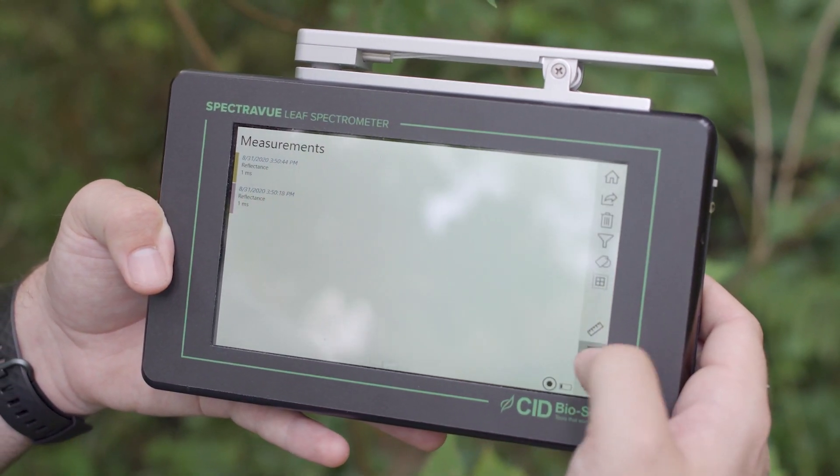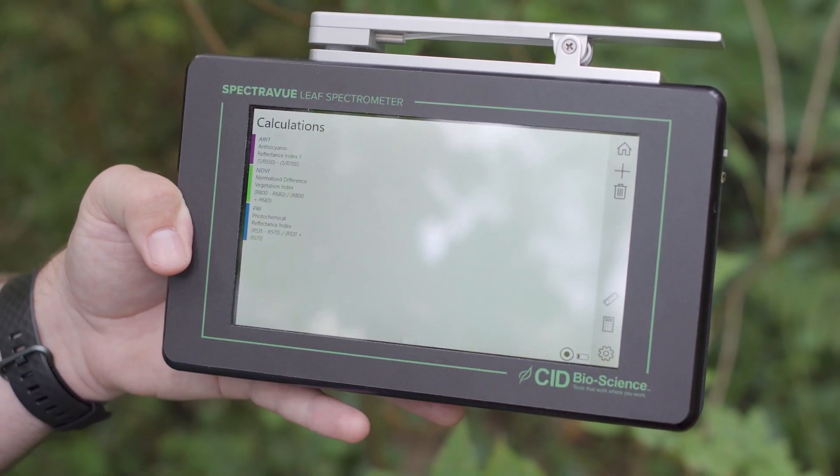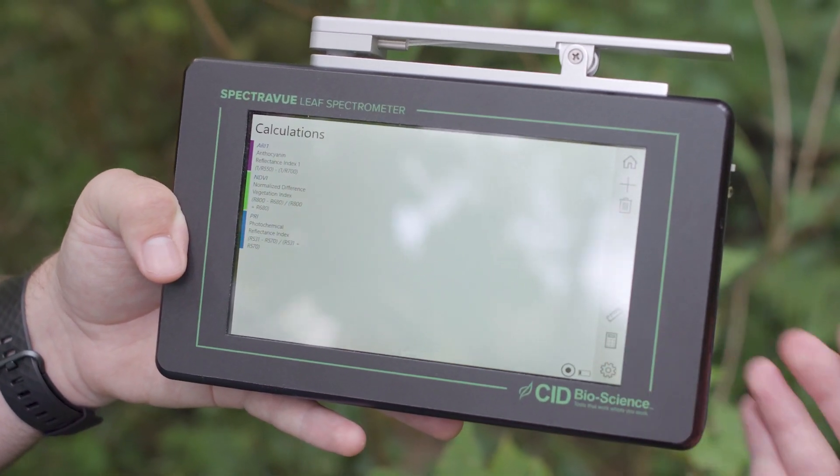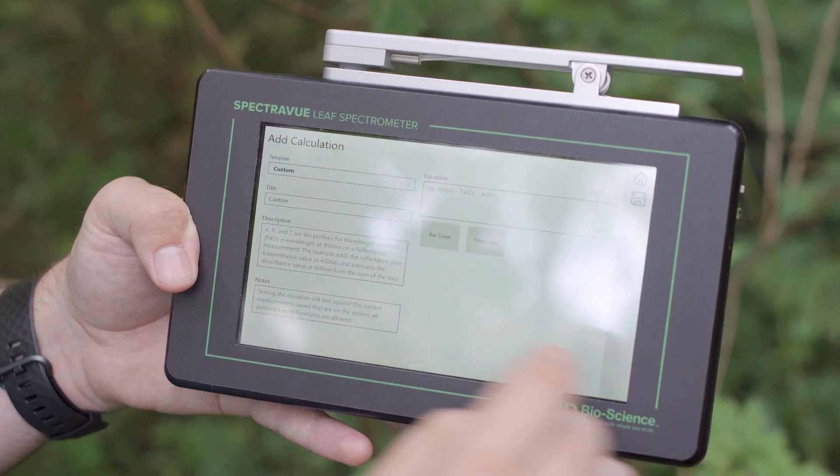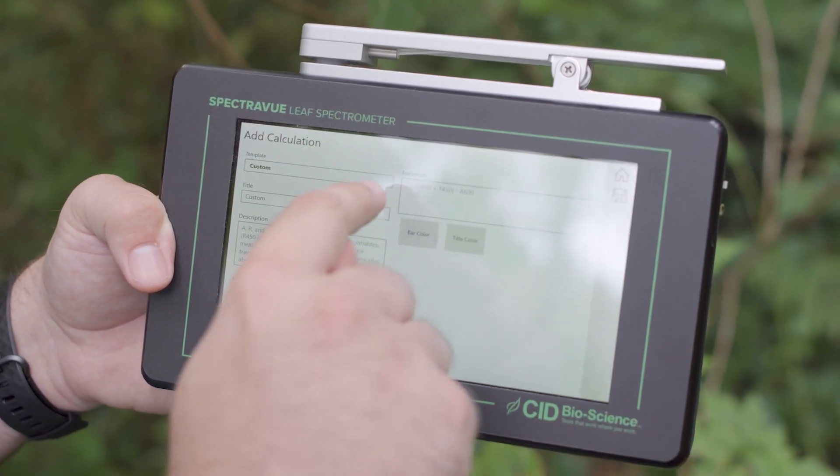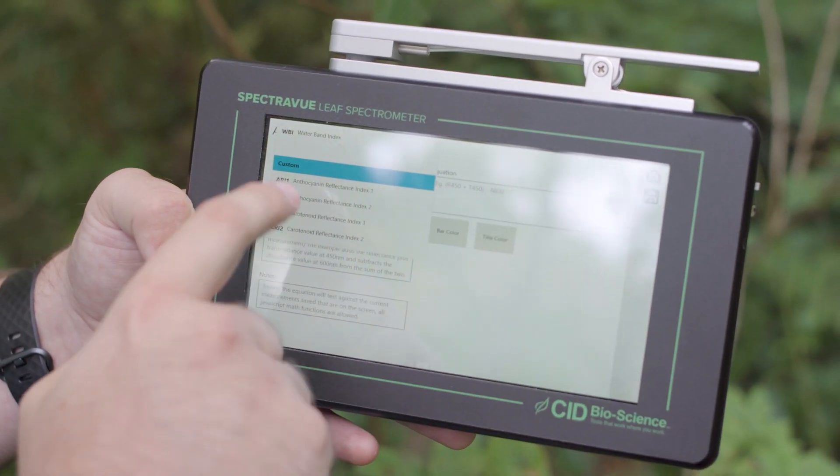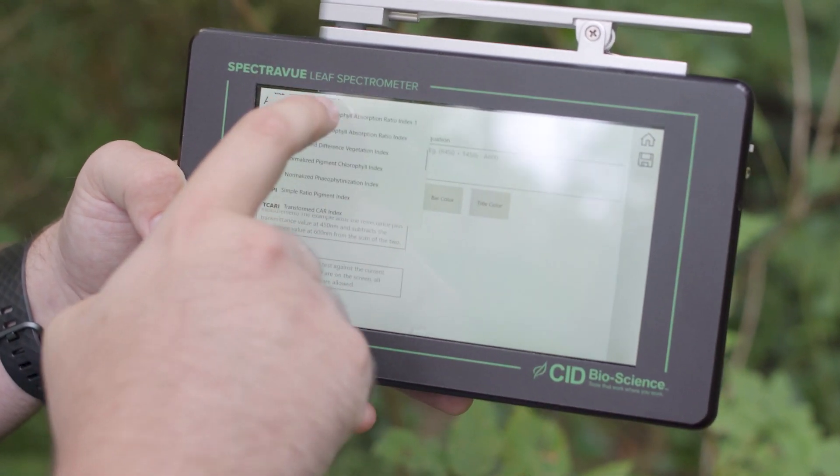And then if you want to change your actual indices that you've chosen, you can go to the calculations sheet by clicking the calculations button. Then you can add new calculations or indices by going to this screen and adding either a custom index or any one of the preloaded indices.